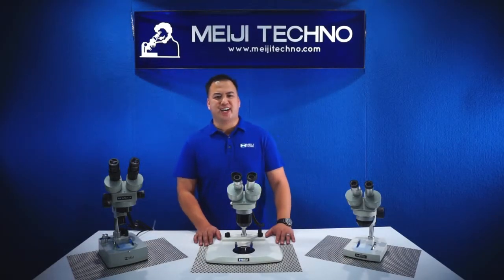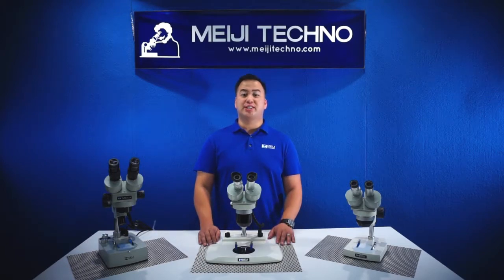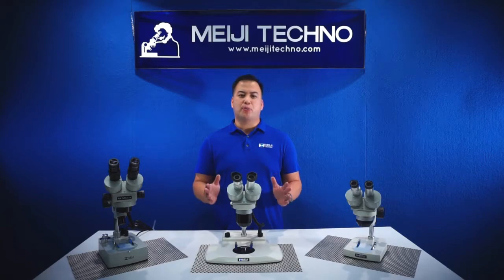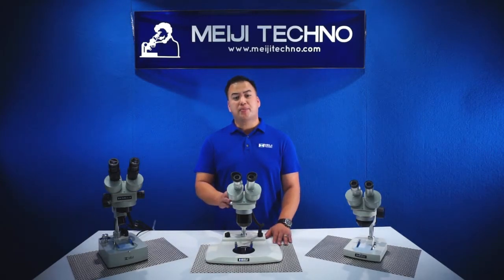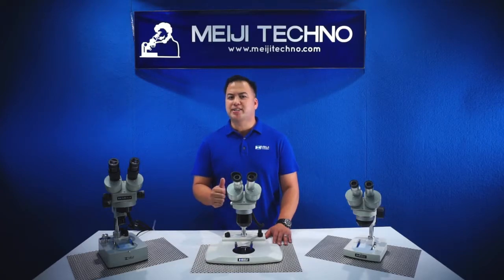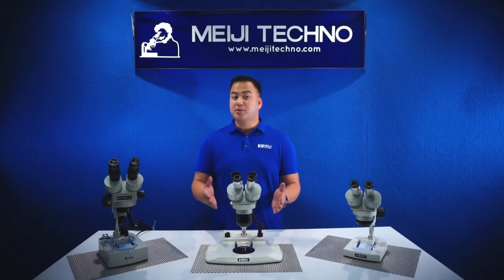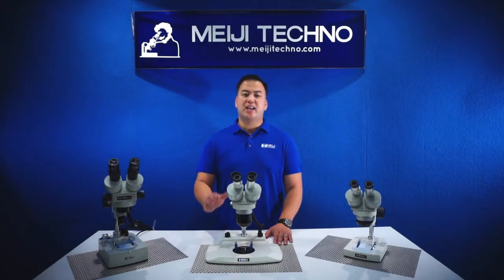Welcome to Meiji Techno. Today we'll be demonstrating our most popular modular stereo systems, the EM Series. No other line of stereo microscope can match the combination of superb optics, rugged dependability, economical pricing, and a wide range of accessories offered by Meiji Techno's EM Series Stereo Microscopes. The EM Series Stereo Microscopes are tailored to fit the needs of each and every user.